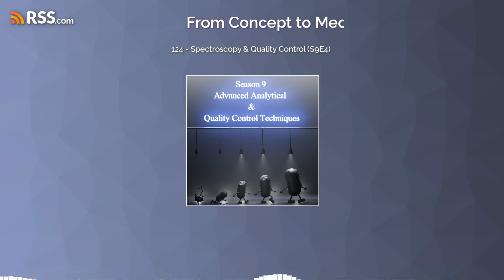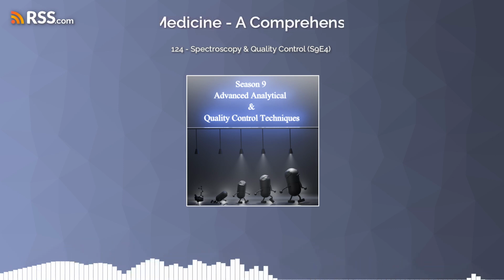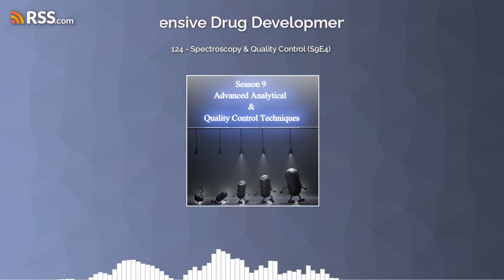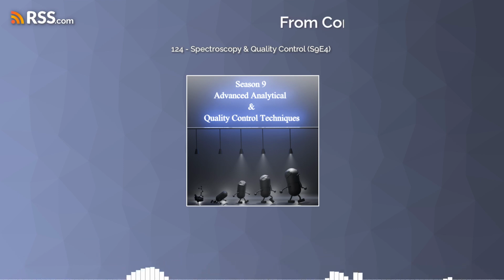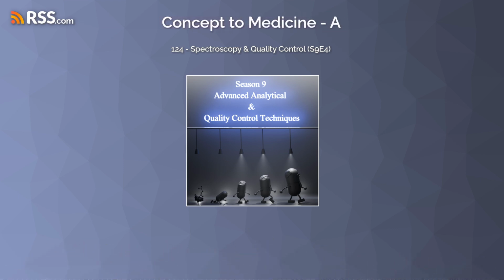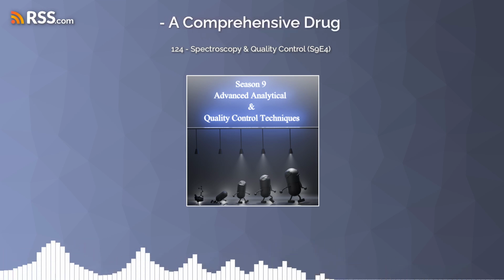So the final pill or the liquid that you would take, how does spectroscopy play a role there? Right, because it's not just about the active ingredient. It's about how it's all put together into the final product. So we can use spectroscopy to characterize the formulation. For example, we can use IR and Raman to look at the solid state of a drug. Solid state. Yeah, so things like polymorphism.